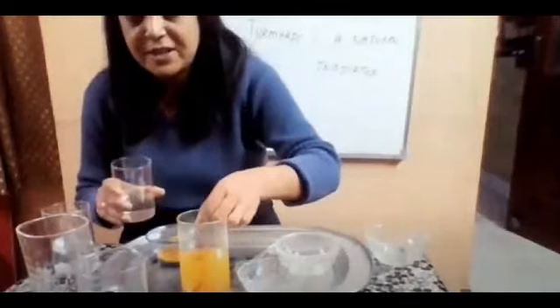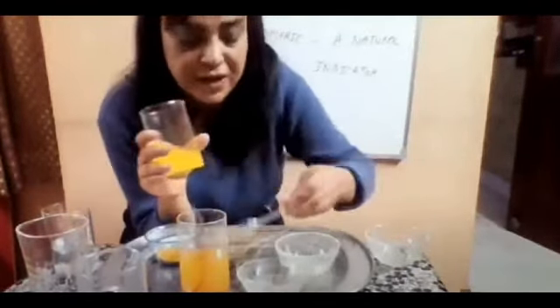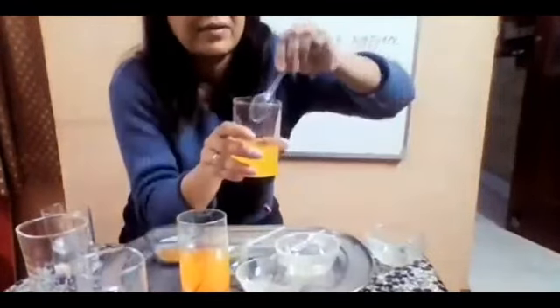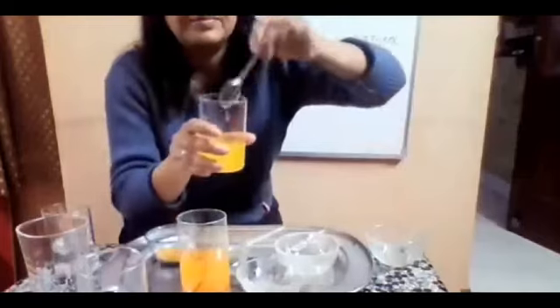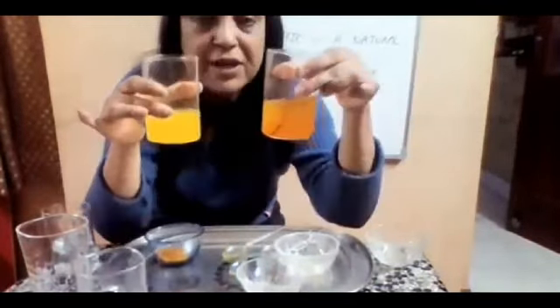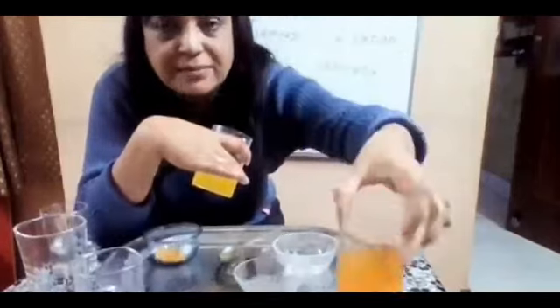Another substance to be tested. This is vinegar. I am taking vinegar. Can you differentiate between the two? Yes, ma'am. Reddish, orangish it looks, so this is your baking soda, right? Yes, ma'am. This is no change.